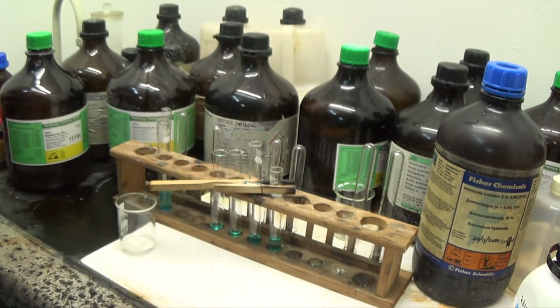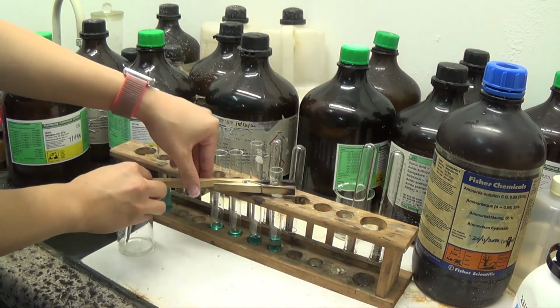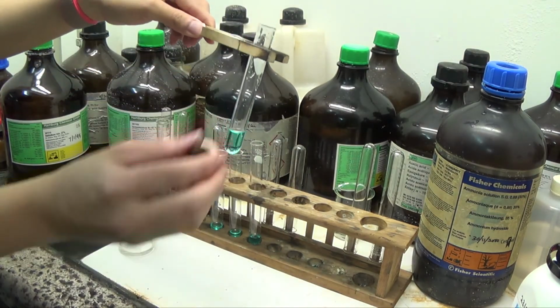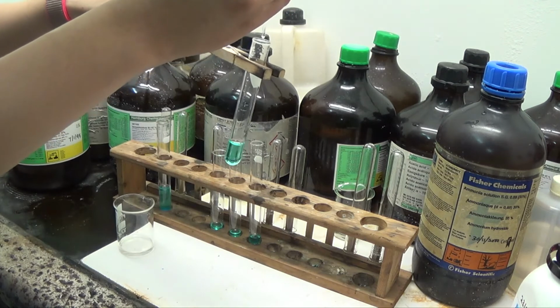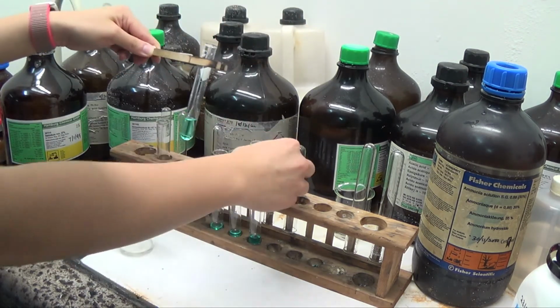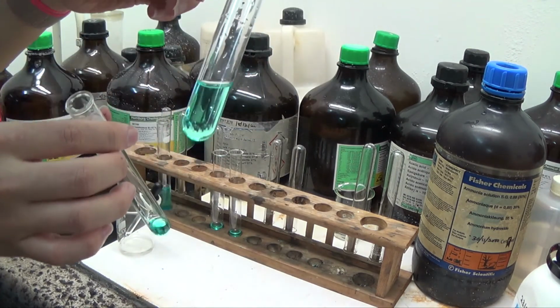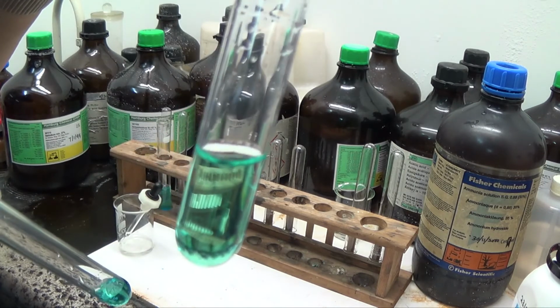What I'll do is I'll just take a plastic pipette. Remember this one just now? Blue solution, I add hydrochloric acid to it, and it's supposed to change color a little bit. So this is the original blue color and it's slightly gone a bit greeny. Okay?